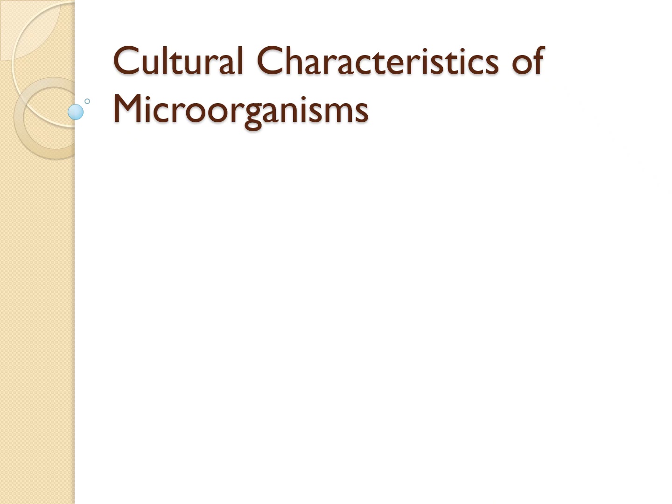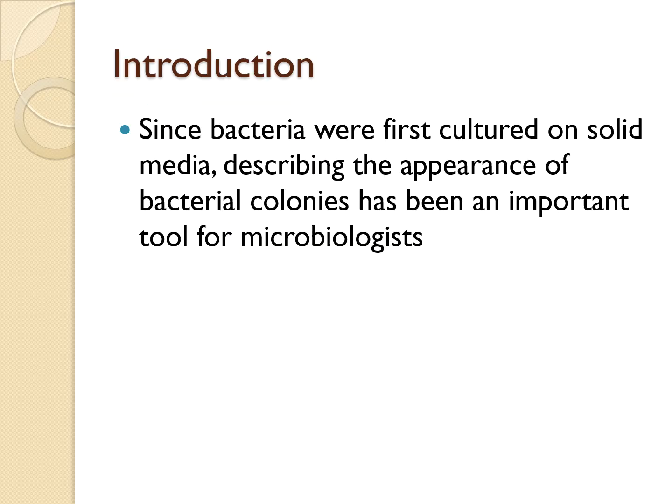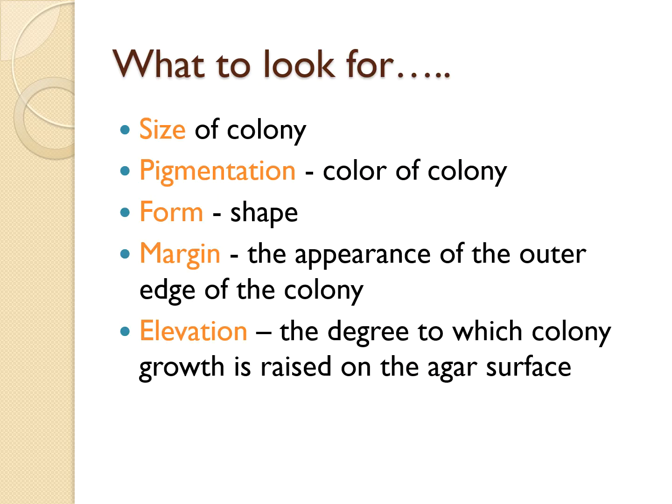Hi, everyone. Just a quick presentation on the cultural characteristics of microorganisms. In other words, what are you looking for? Since bacteria were first cultured on solid medium, describing the appearance of the colonies has been an important tool for microbiologists. So what are you looking for?